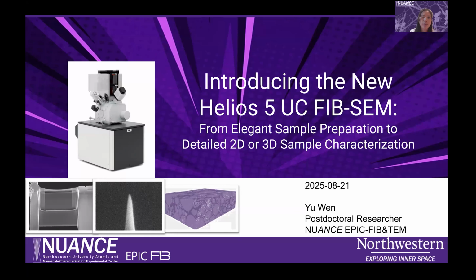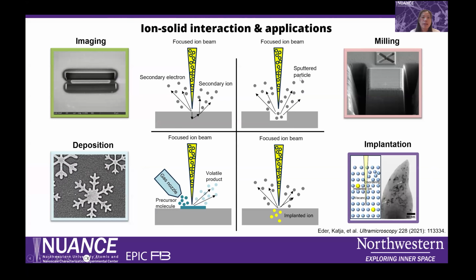So starting from the ion-solid interaction, it's a relatively complicated process. So here we break its effect down into four main functions when a focused ion beam hits a solid.